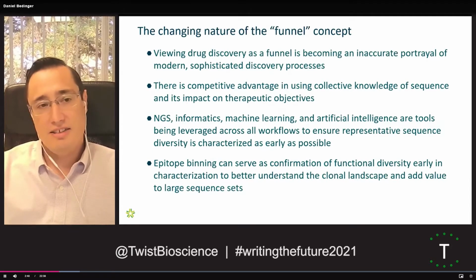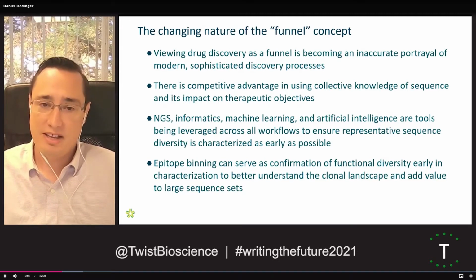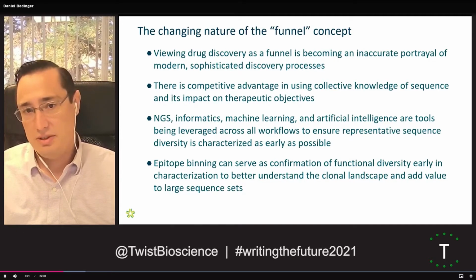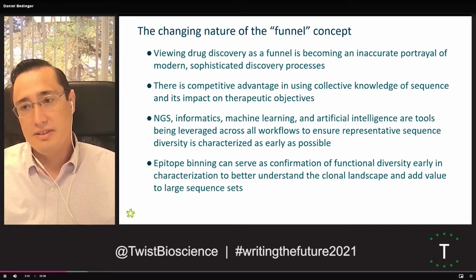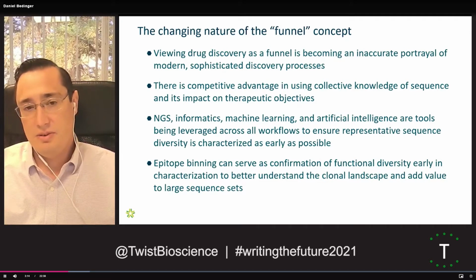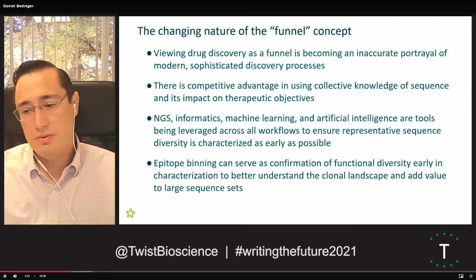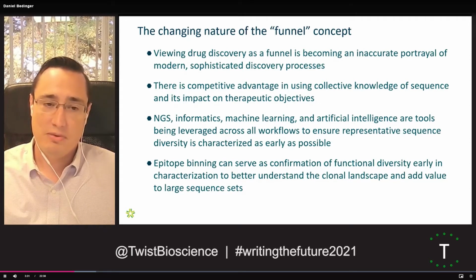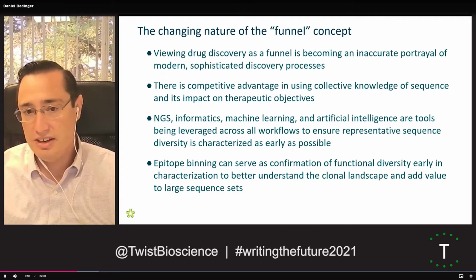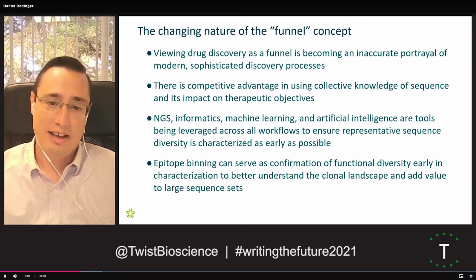So this is kind of changing the concept of the funnel, where instead of having a huge number of clones that have to go through very low resolution assays early on, you can assess your genetic diversity and make really strategic decisions about the type of data you generate early in the funnel and how that experimental information you get from these characterization assays relates to this whole collection of genetic diversity you have within your library. So if you have a good platform to generate large amounts of early characterization data, and you have the next-gen sequencing data where you have good sequence information for all of those clones and hopefully many more, you can feed that into bioinformatics systems and use things like machine learning and artificial intelligence tools to really give you a clear picture of how the genetic diversity in your set relates to the functional activity of the clones within.